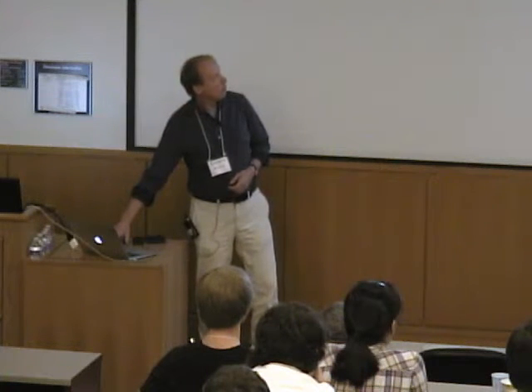All right, those are the sorts of things that we would see if we have a spin 1/2. And the question is, what happens when our spin gets bigger than 1/2? So if we have more than 1 unpaired electron in our molecule, we have an additional interaction which is known as the zero field splitting. This is a result primarily of spin-orbit coupling, but depending on the situation, there's also a contribution from the dipole-dipole interaction between the electrons.